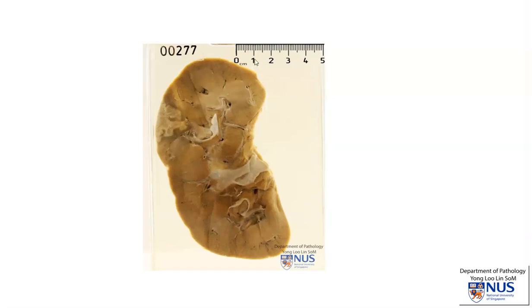Hello. This is a specimen of a kidney that has been longitudinally bisected, and we're looking at the cut surface. We can see the cortex, the medulla, and this is the renal pelvis.